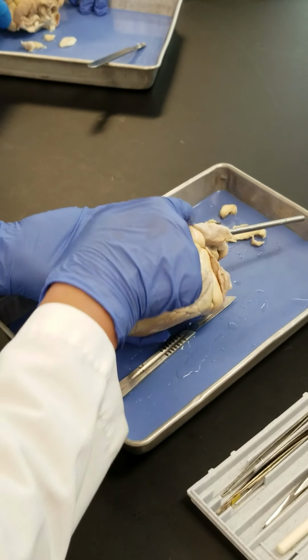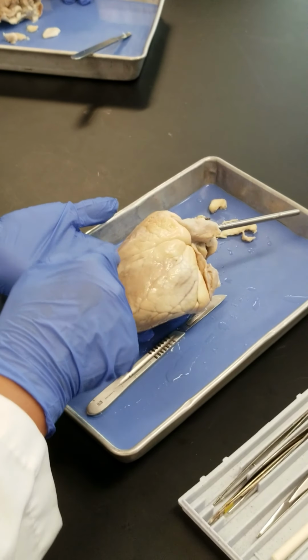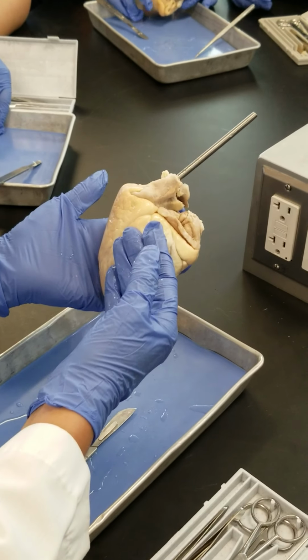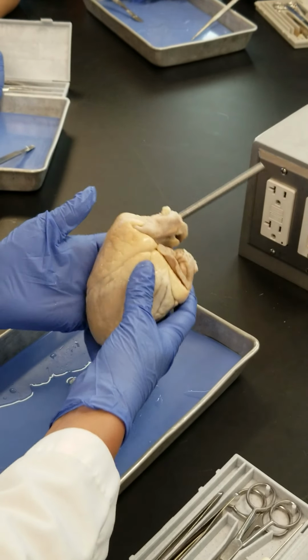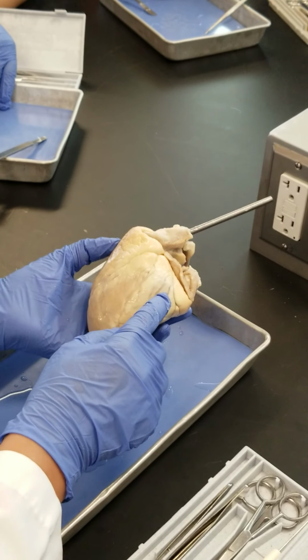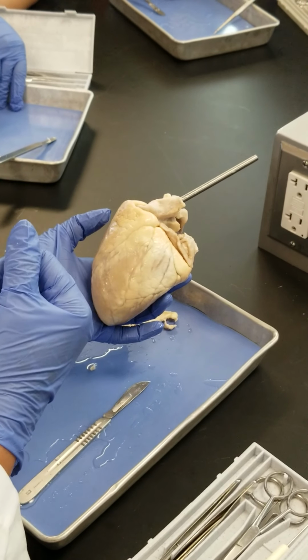Therefore, which chamber is this one? The right ventricle. When you are looking at the heart from the anterior of that heart, your right side is its left side, your left side is its right side, right? So this is the right ventricle, this is the left ventricle. This is slightly different from the human heart.